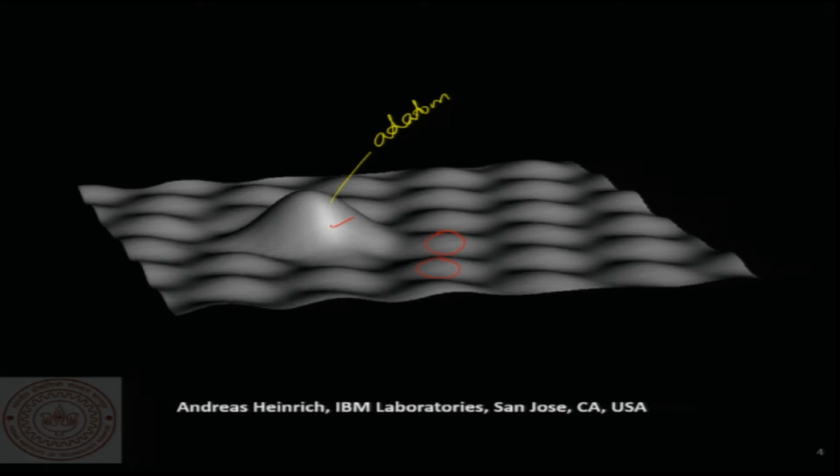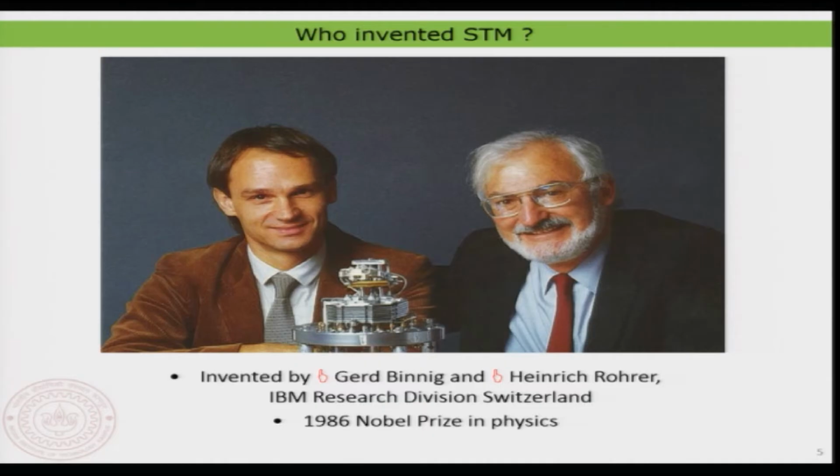It is unimportant in this context what type of material you are using, because later you would find that it is hard to get material-related contrast in STM. Nonetheless, what you would be looking at is the electron density of the surface, but with that you can recognize the different positions of atoms on the surface, or what happens if you put add atoms on the surface, and so on. We will look at several examples from now onwards, and then you can understand this a little bit better.